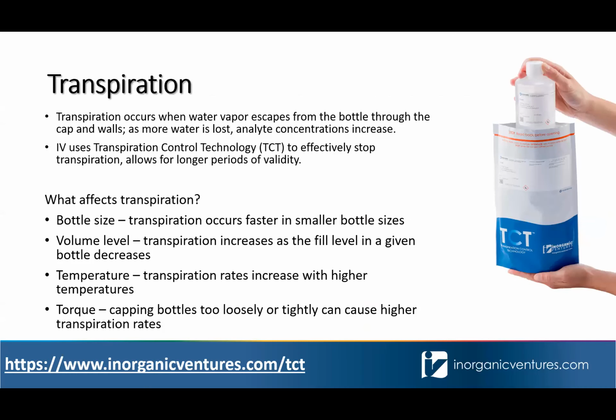So in this slide, I want to talk about transpiration. I mentioned it earlier when I was talking about the expiration of your working standards. So basically, transpiration is the passage of water vapor from your solution to the outside environment.